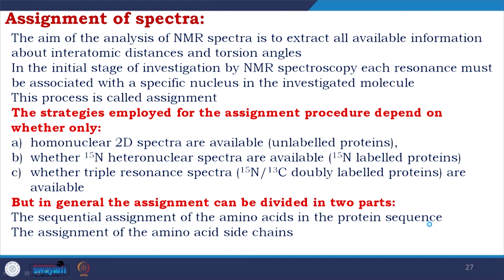So, first we develop the backbone, that is the first step, and then we want to add the side chains R1, R2, R3 in that.